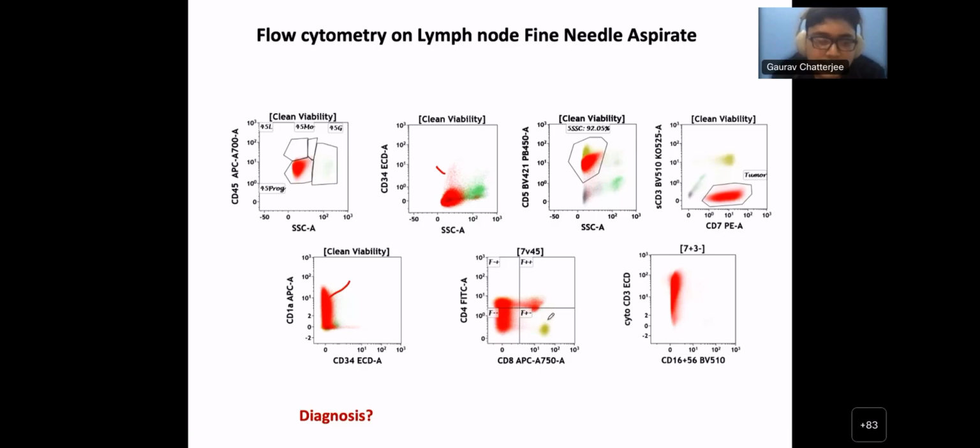Gaurav, in this case, yes, sir, there is a question in the audience. Do we call blast on the basis of CD1A expression only, as CD34 is negative?